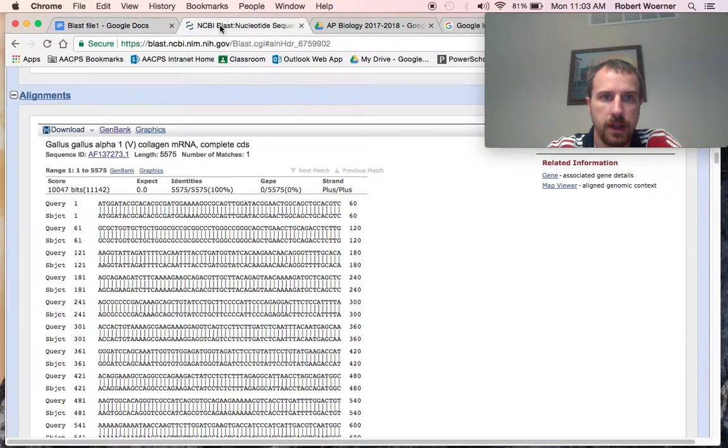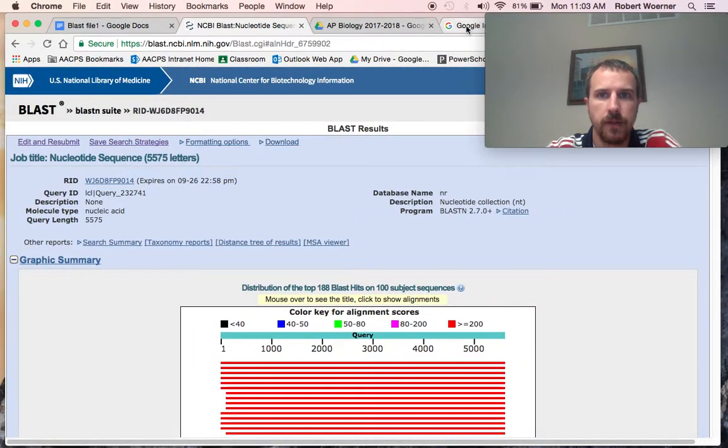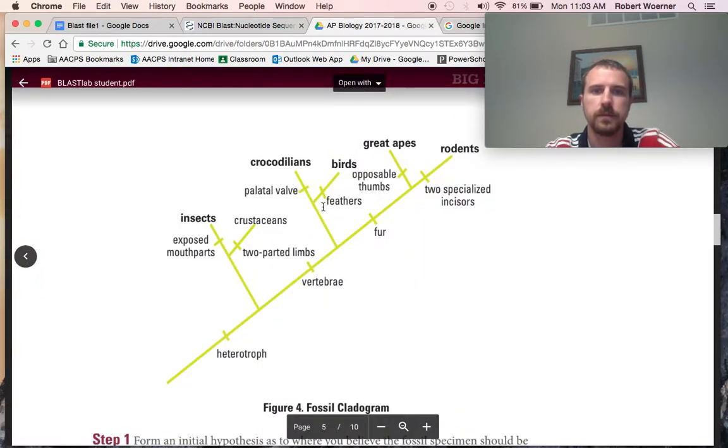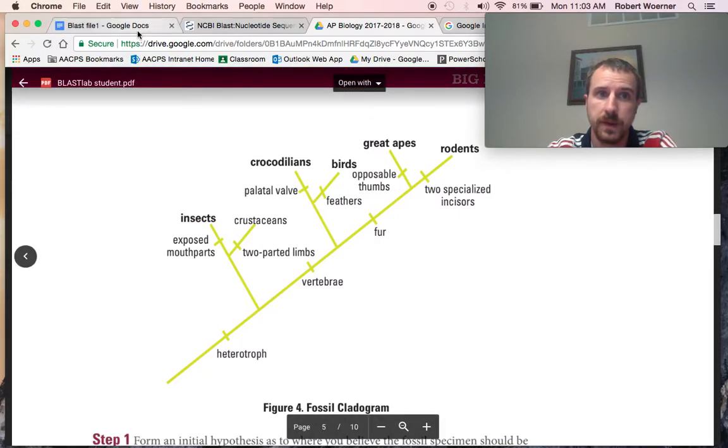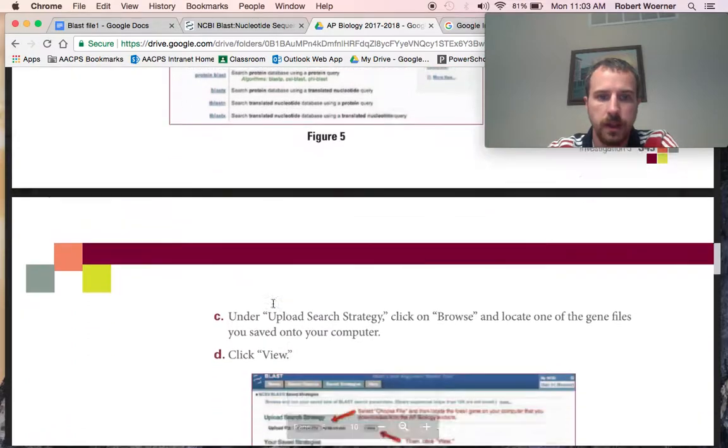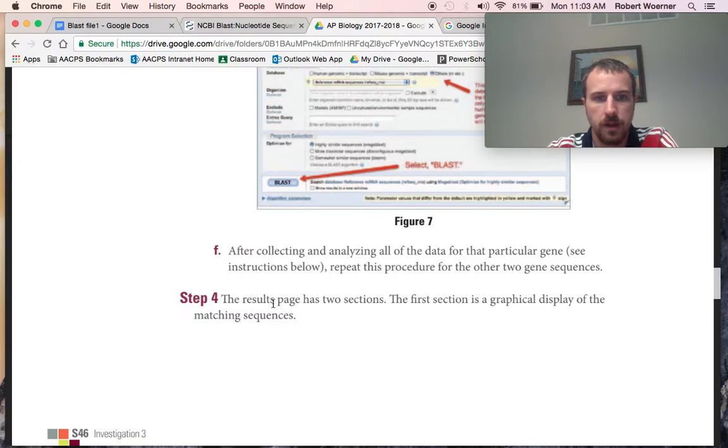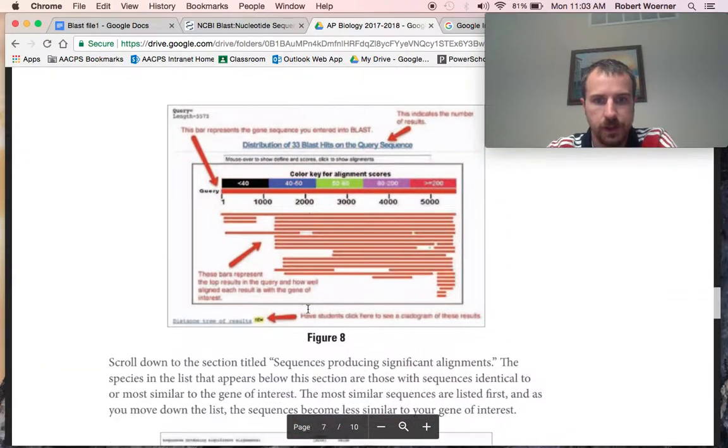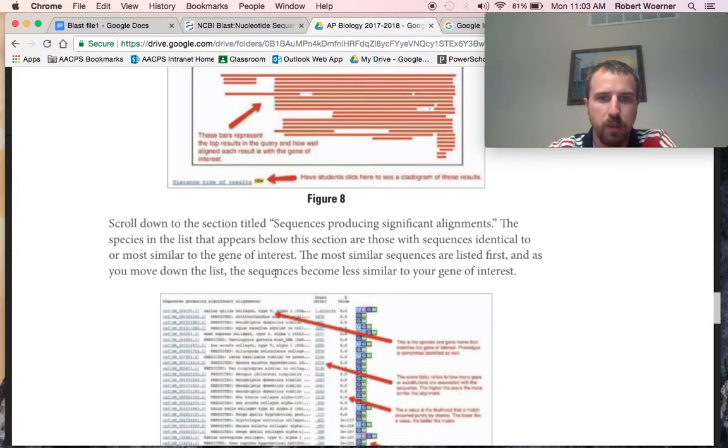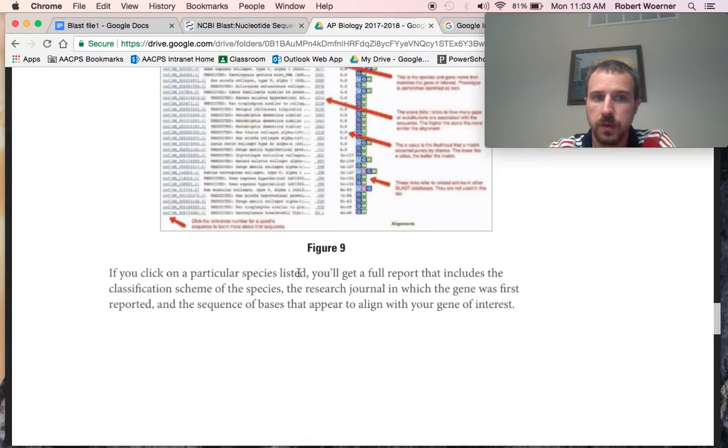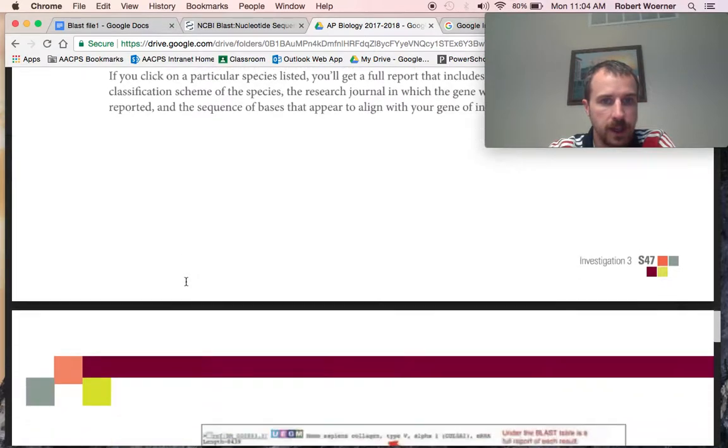What you need to do is you need to go into BLAST and do that for each of the four different BLAST files, four different sequences. Once you've done all four, then you can make a better determination where things are. Look at the sequences. Always pick that top one. It will help you the most. It will be the most related. You'll get a full classification scheme of it. You'll get how things are related.